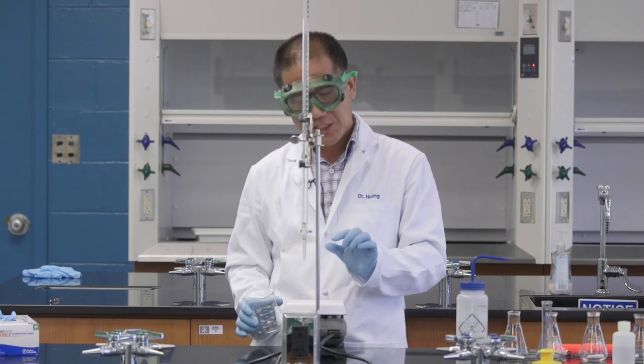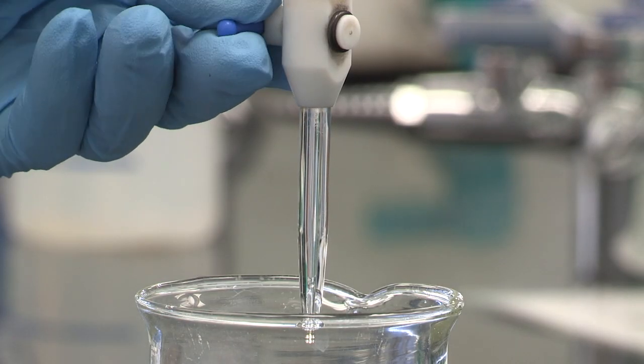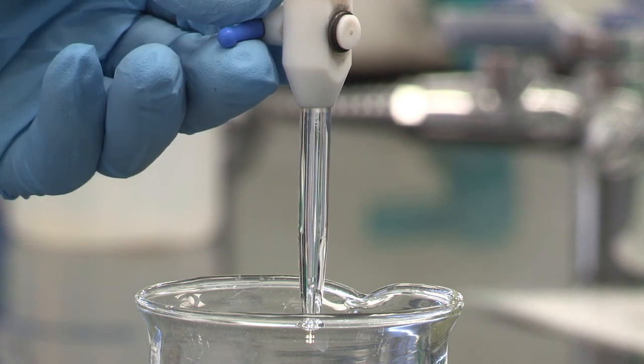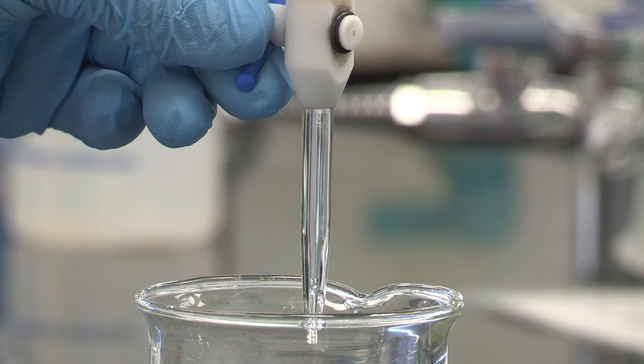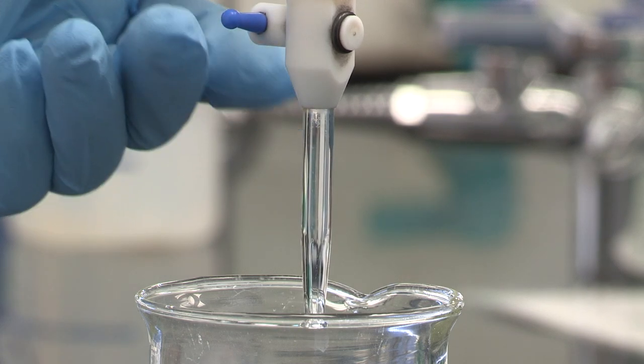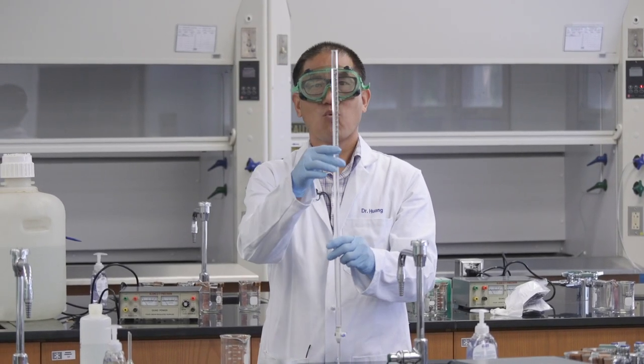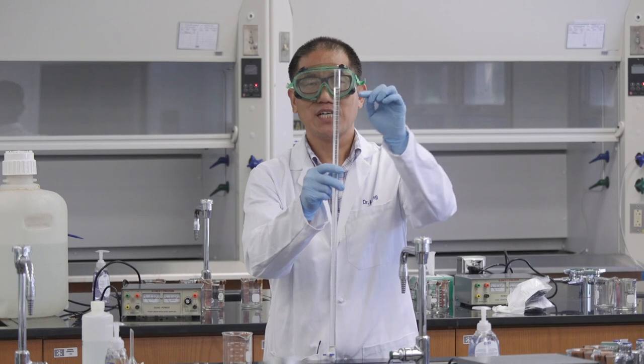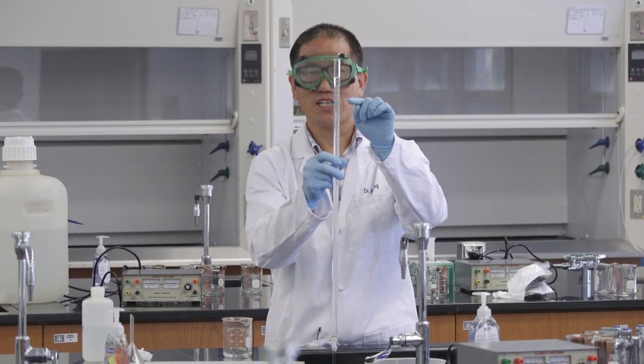And then, we have to make sure there's no bubble in this part. Let's say if you can see the bubble. Let the bubble come out. After you get rid of the bubble, what you want to do is make sure the meniscus is aligned with the zero milliliter on top.